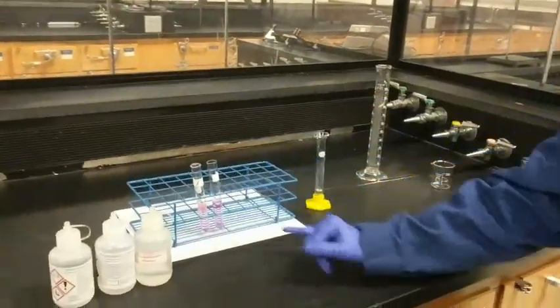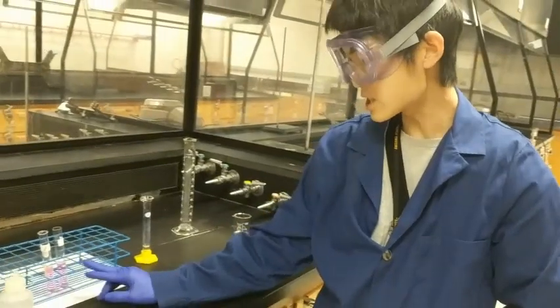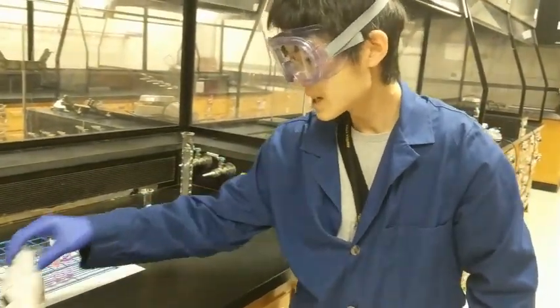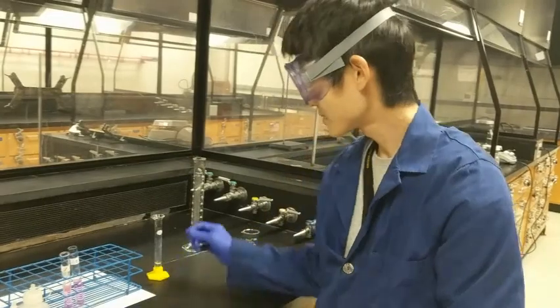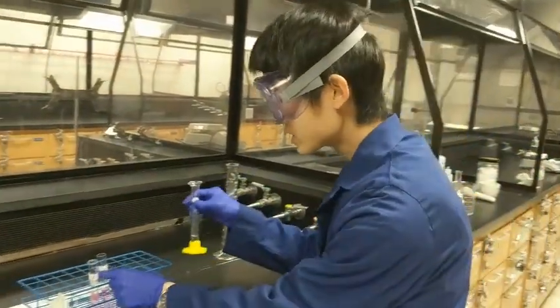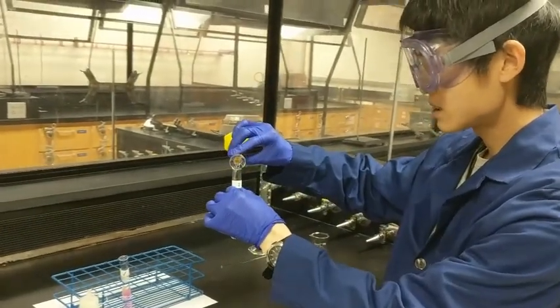So the first test tube is going to be used as a reference, and to the second test tube you're going to add 2.5 milliliters of ammonium chloride solution. So we have 2.5 milliliters of the solution, and I'm going to add the solution to the second test tube.